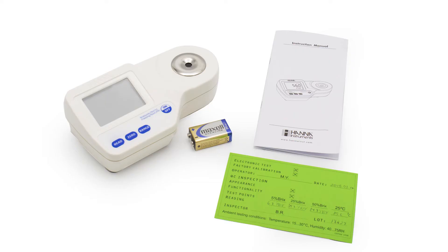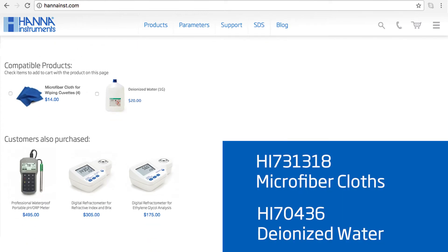Your meter includes one 9-volt battery and the instruction manual. I recommend you check out our compatible products on our website. For this meter, I recommend our HI731318 microfiber cloths and HI70436 deionized water.